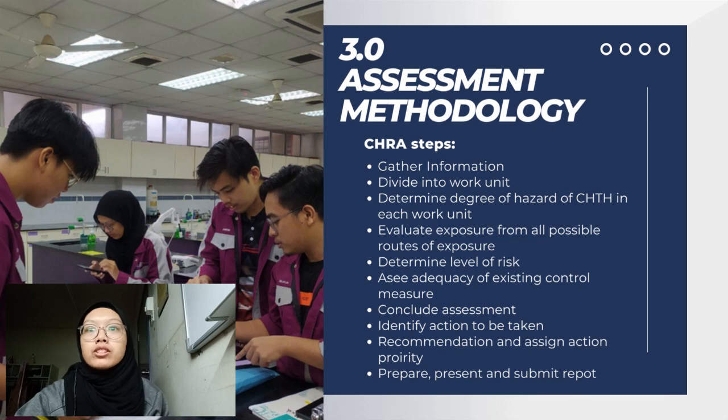Assess adequacy of existing control measures is done simultaneously with the exposure evaluation by inspection, checking record on control equipment, and procedure including the use and maintenance of PPE. Equipment maintenance is done through preventive maintenance. However, the equipment to control exposure are not maintained. There are no reports of incidents and accidents, no chemical exposure monitoring and LEV testing, and no examination being conducted before.